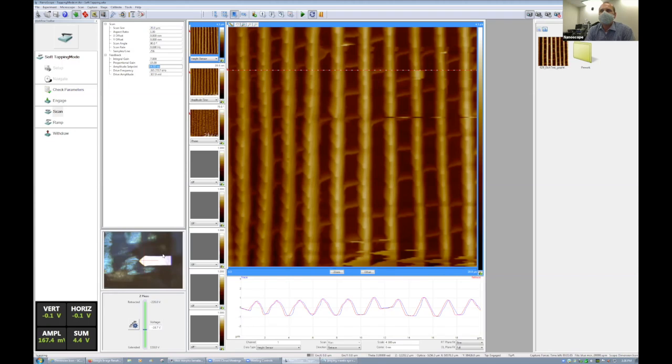Yeah. So you can think about it: you have those lamella and they have a certain distance between them, right? Especially the vertical stripes that we don't really see here, but Angela showed in the SEM images. Now you get all kinds of wavelengths coming in there because that's the sunlight that's coming in. But only the wavelength that can fit between these lamella and get amplified, that's the one that you're actually going to see coming out. And everything else is just going to disappear. So if you change the spacing between those lamella, you would change the color.